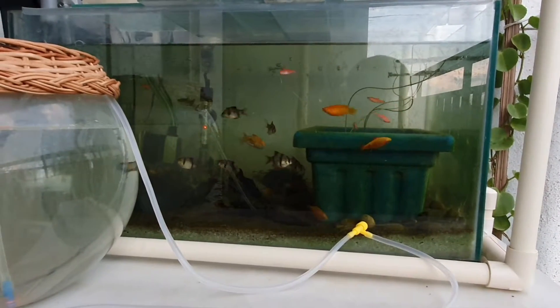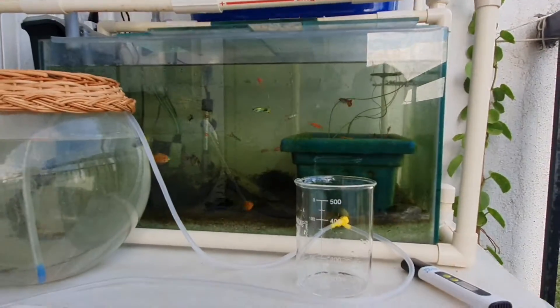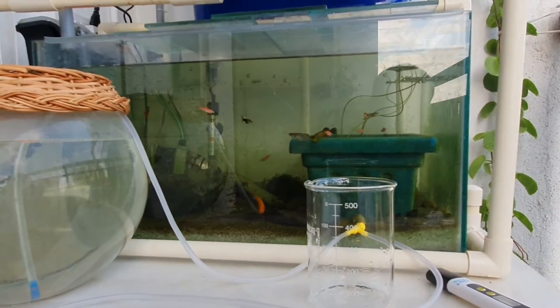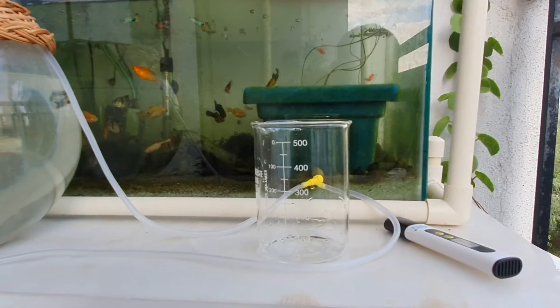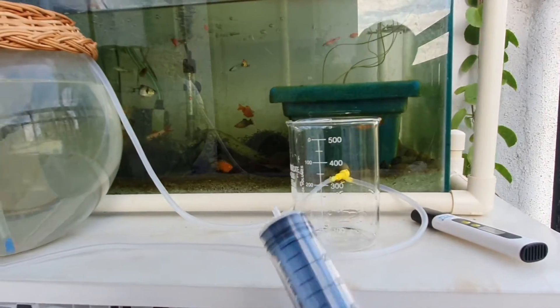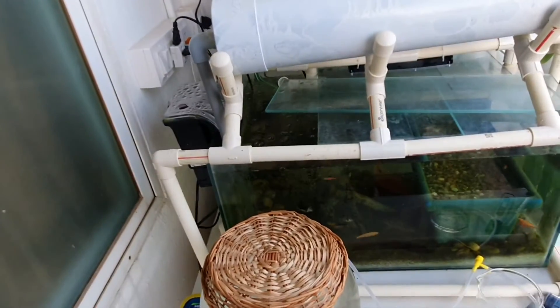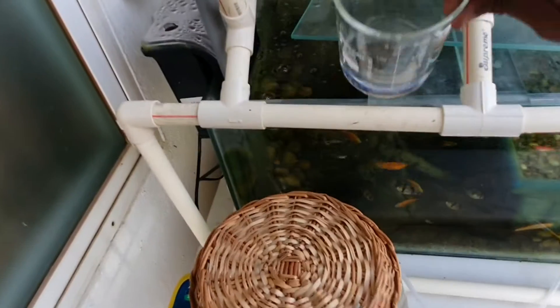Let's do a PPM test on my aquarium water. I'm not sure how my water is — this test has never been done. I have never tested my water. I'm very new to it. Here I am with the PPM meter, beaker, and syringe to draw some water out of the system and see how my water is — is it any better than the tap water?